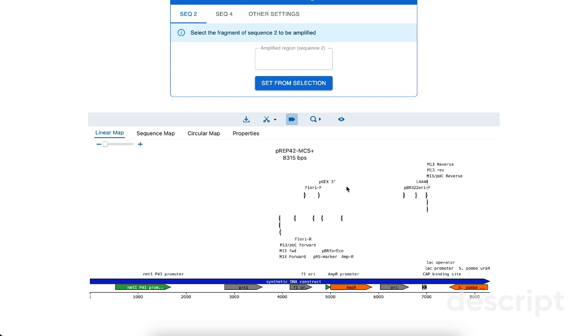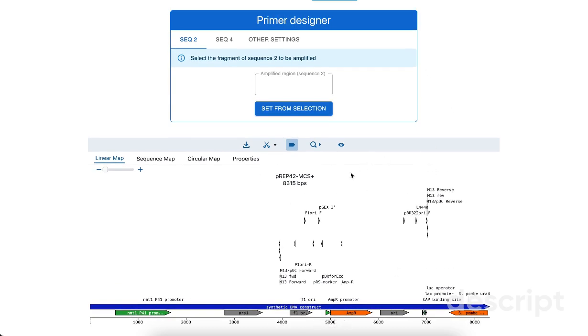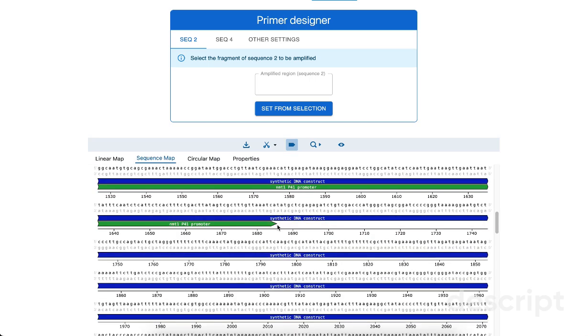So this brings us to a window where we have to select which bits from its plasmid we want to amplify. So for example, if we wanted to join only this bit, we select this. But let's imagine a more realistic case where we maybe want to clone the entire sequence of ACE1 after this promoter. So we want to keep the whole plasmid, want to amplify the whole plasmid, but instead at a given position the coding sequence.